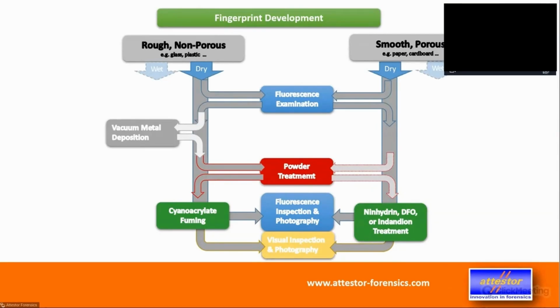Right, so the first slide is just a very, very simplified graph of fingerprint development, just to show you where our products are actually settled. Obviously, regardless of whether you work with non-porous material or porous material. By the way, do you see my mouse moving? Yes. Okay, good.